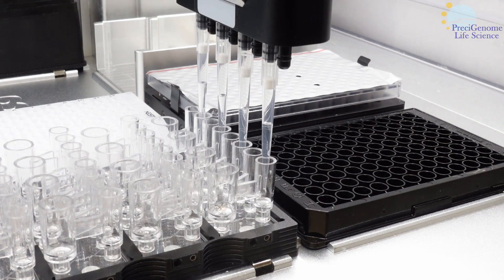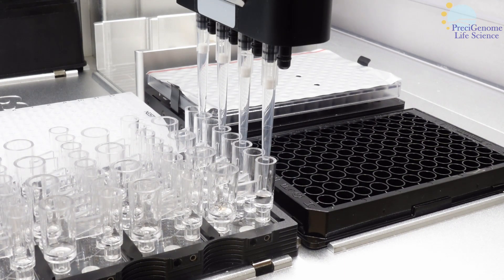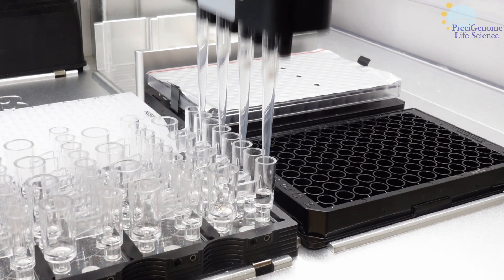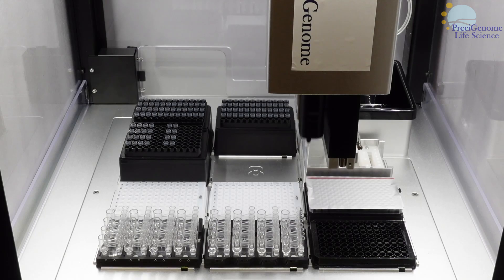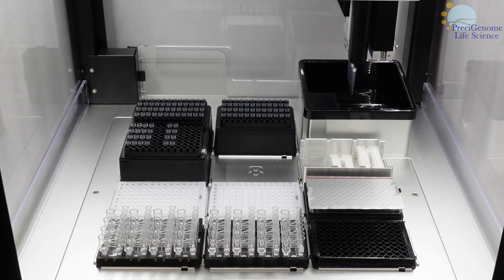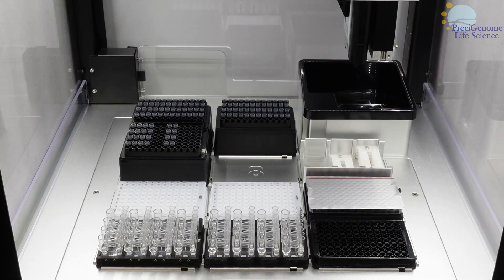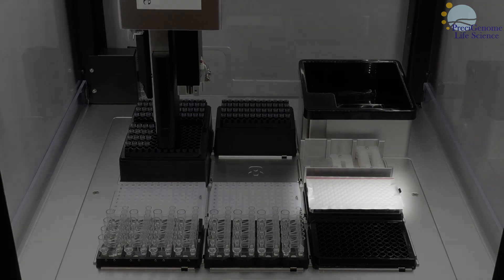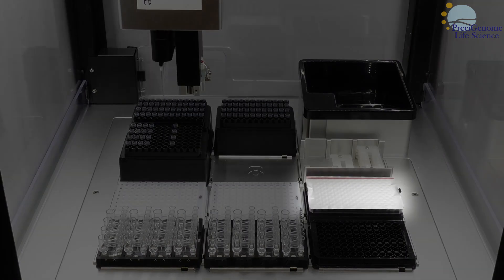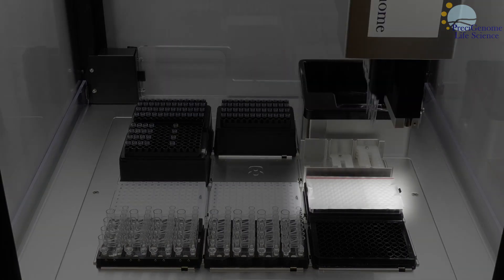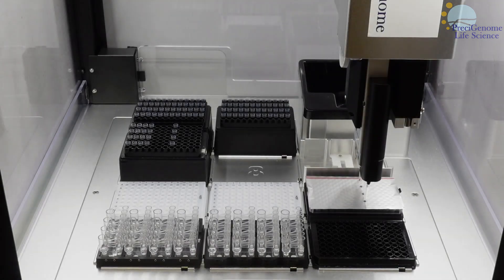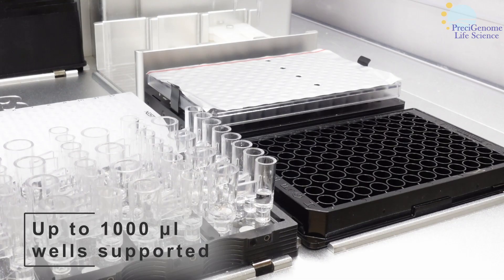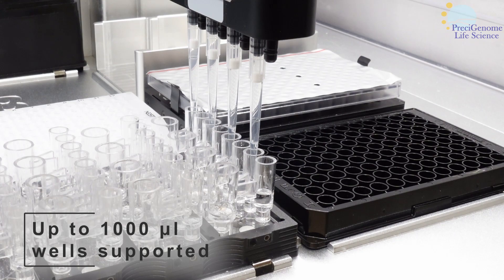The slots on the deck are used for consumables such as pipette tips, 96-well plates, gaskets, and mixing chips. Plates sealed with foil are supported by the machine, as are plates of different well capacities.